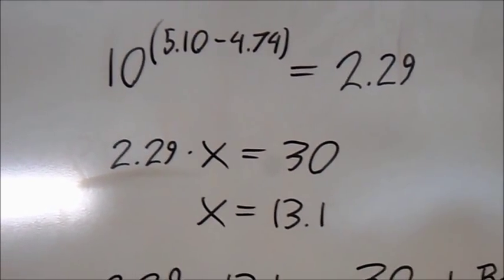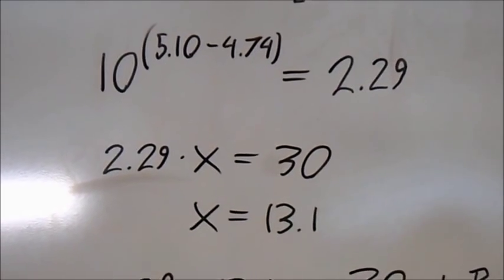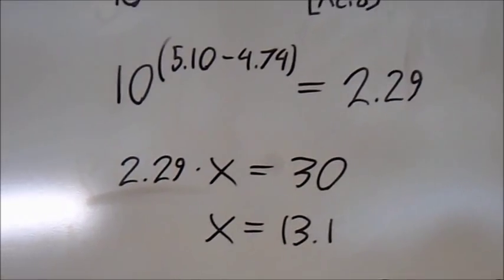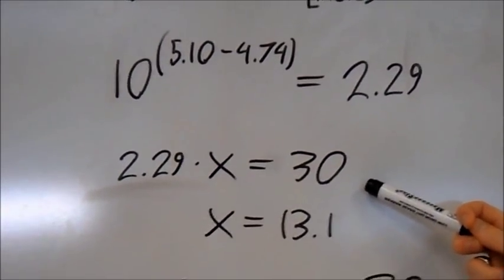Now, the solution we're going to manufacture must be between 30 milliliters and 50 milliliters. So to start, I'm going to get 30 milliliters of base.